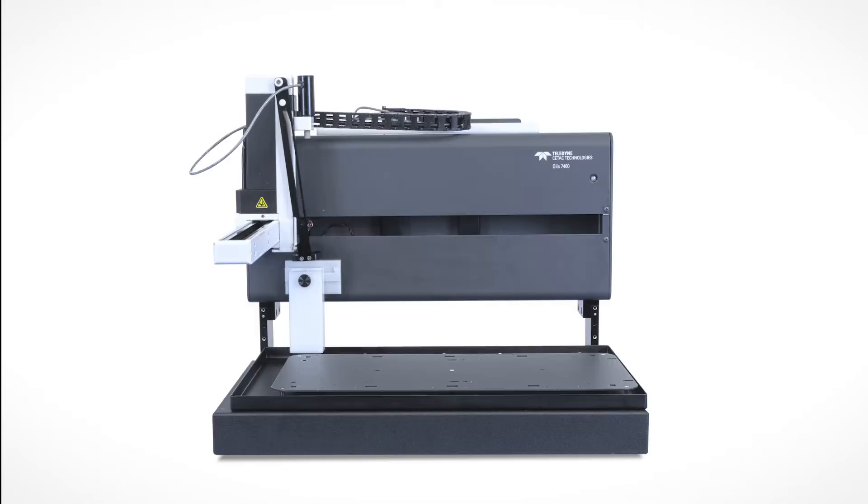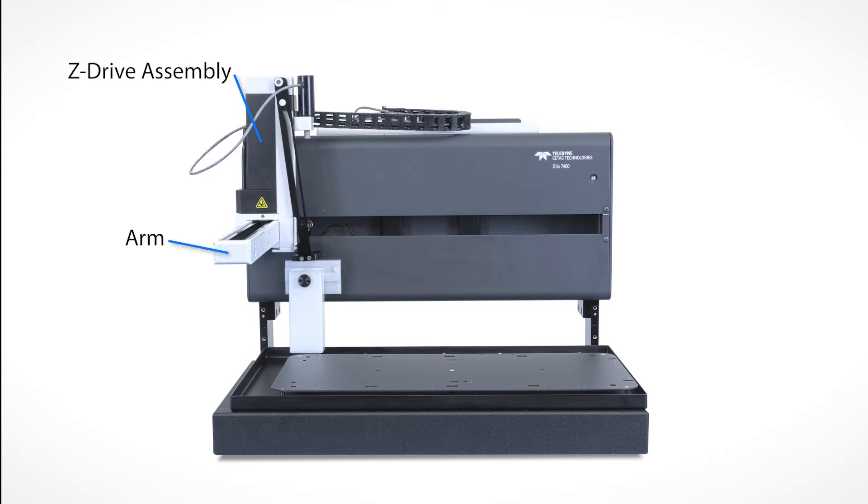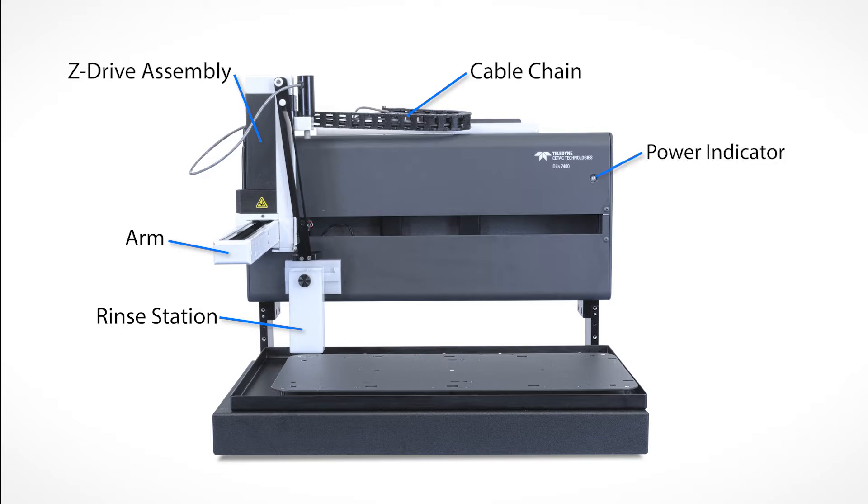Before you begin, familiarize yourself with the parts of the Auto Sampler. In front are the Z-Drive assembly, the arm, the rinse station, the cable chain, the power indicator, and the sample tray.